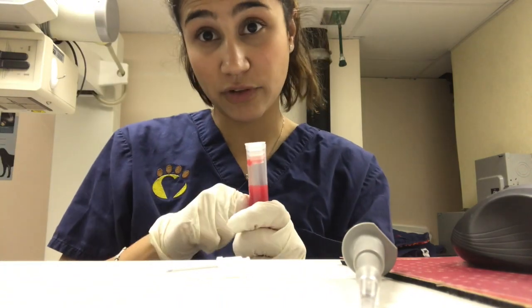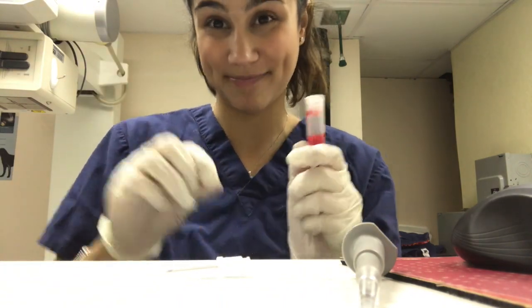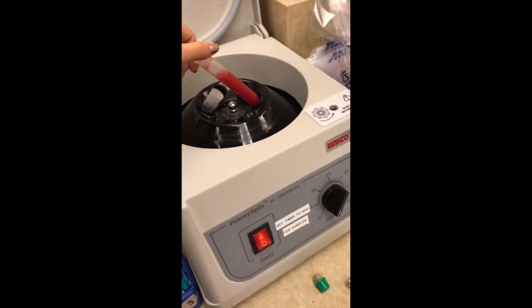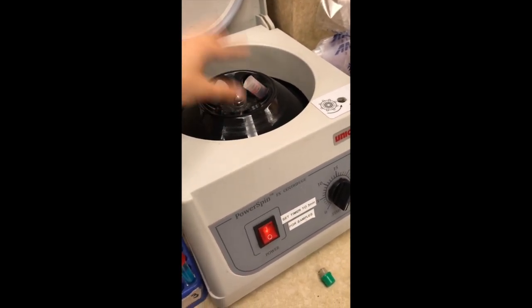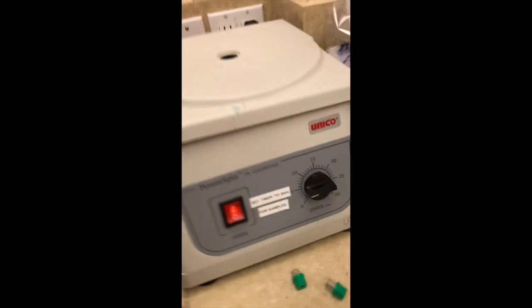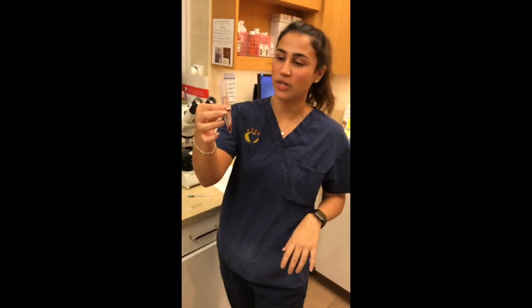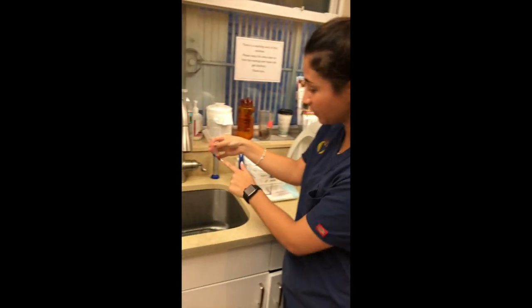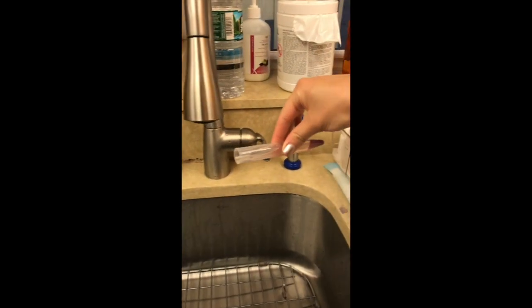And now I'm going to centrifuge it for 5 minutes at 1500. I'm now going to centrifuge our mixture of our anticoagulated blood and our formalin for 5 minutes. Okay, so I just spun our tube down, and you see here we have the supernatant. So I'm actually going to pour that off, just right into the sink. I'm going to be super careful not to disrupt the bottom of the contents.